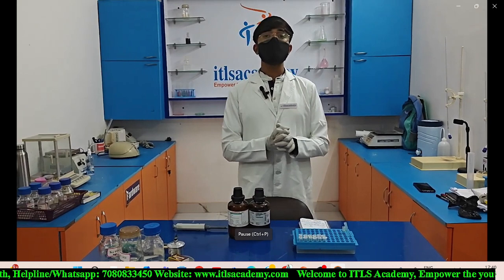So after refrigeration for 15 minutes and after performing the centrifugation, now we need to discard the supernatant of each eppendorf, and after discarding the supernatant of each eppendorf, we need to add further 0.5 ml of chloroform and 0.5 ml of phenol in each of the eppendorfs, and further refrigerate it for 15 minutes, and after performing the refrigeration we need to undergo centrifugation at 5000 rpm for 15 minutes. But you need to make sure that while you're dealing with the phenol, you wear proper gloves, mask, and all these things. It would be helpful for your health.